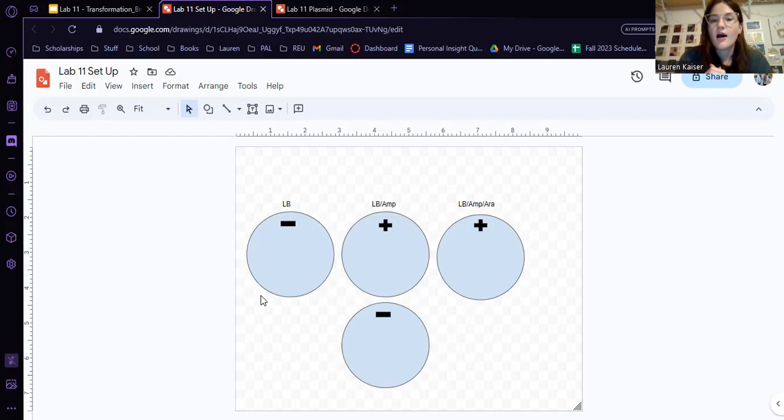Sweet. This also says that no bacteria that weren't touched, the ones on the control, that bacteria wasn't already having the beta lactamase. So that bacteria was sensitive to ampicillin. That's what these two plates will tell us.